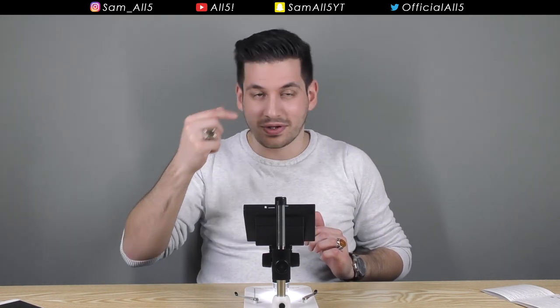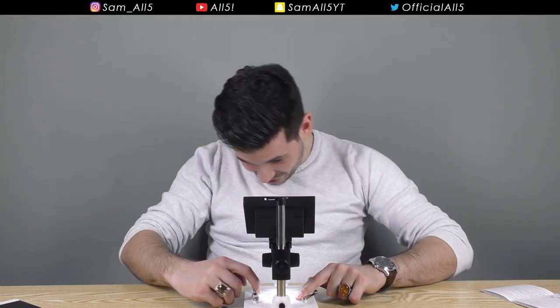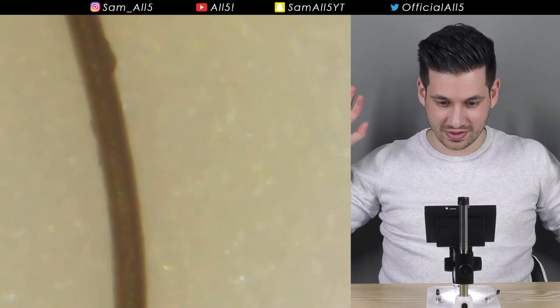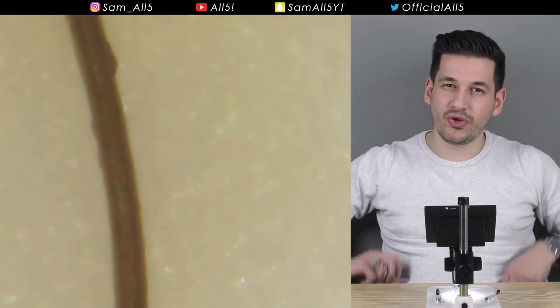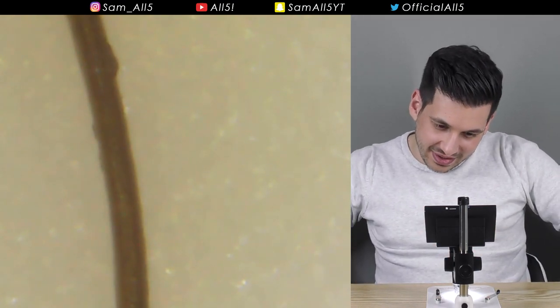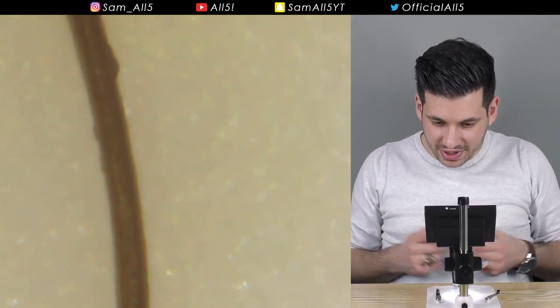I'm going to try and find some interesting stuff to put on the microscope — maybe a dead fly or something. Oh, a human hair! Let's get one of my eyebrows. I'm doing this for science — plucking my own eyebrows on camera. There we go. That's my hair, but that's not zoomed in fully. Zoomed in fully — that's insane. You don't realize how smooth your hair is; it looks like a tube, almost like a wire under the microscope. That is crazy.